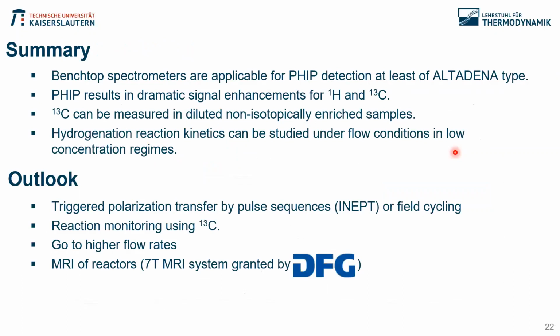As a summary, I think you see that PHIP gives dramatic signal enhancement, as we all know, and makes single scan spectra very well suitable also in benchtop devices. And of course, this reaction is not the most interesting one.